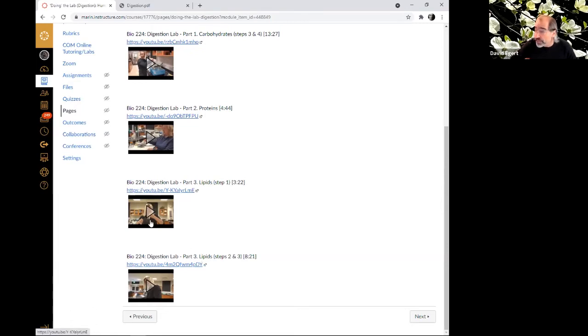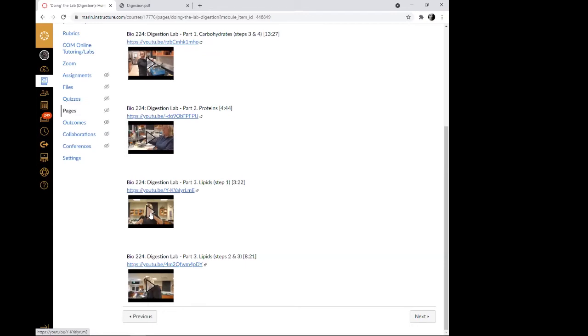So let's play that. This is going to be Tina showing what it's like if you mix oil and water with and without bile salts and just wait a little while and see. Normally, if you mix oil and water and then wait a little while, what happens to the mixed up oil and water droplets? They separate, right?